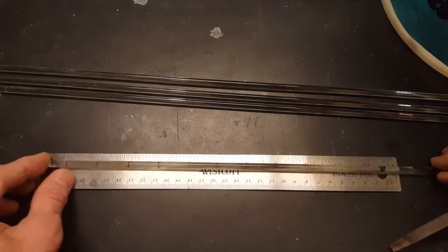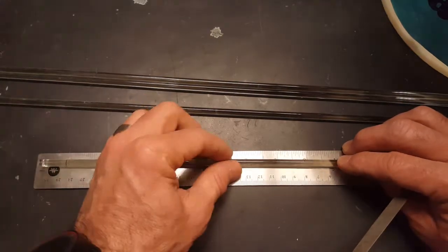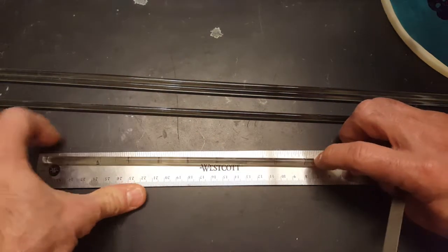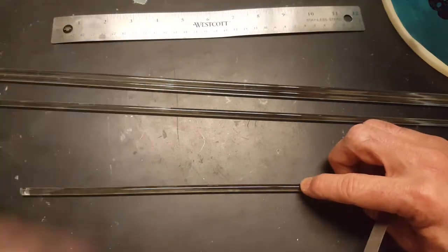Step one: take the glass dowel and mark a point on the dowel that's about nine inches long. Nine inches is a very good stirring bar length.